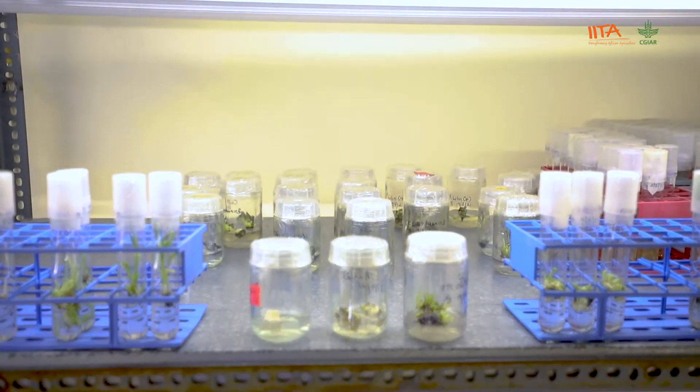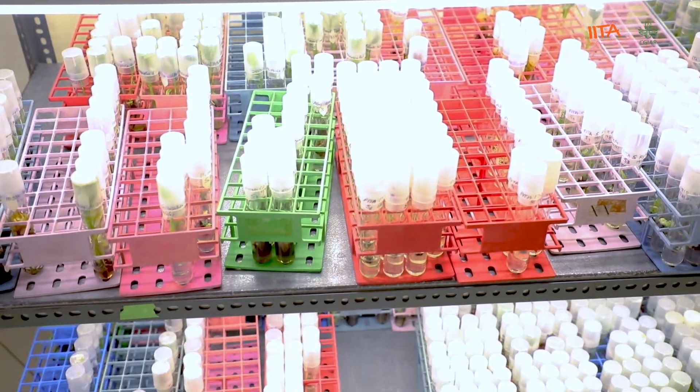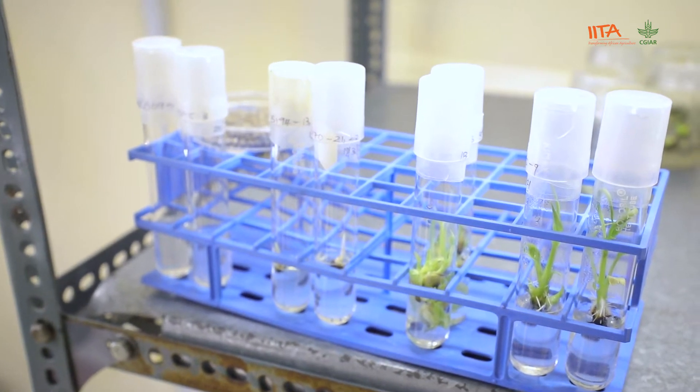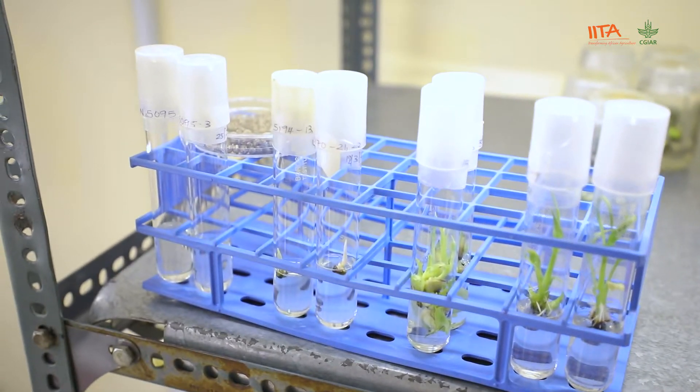To facilitate germination, we put the seeds in tubes so that we can pamper them well in the lab and they can germinate easily. Here is a fresh embryo, and here is one that has already germinated. When they germinate, we multiply them so that we can get plants that can go out in the field.